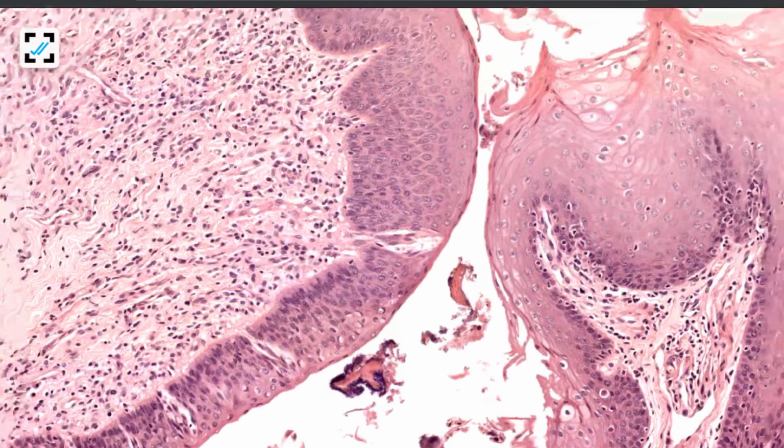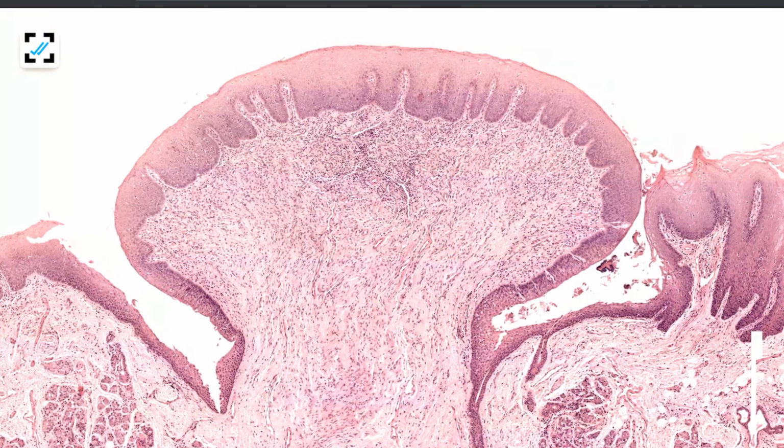To quickly summarize, circumvallate papilla are the largest papilla present in the tongue in front of sulcus terminalis. Each papilla, when viewed from above, appears round, surrounded by a trench or moat. The characteristic feature of circumvallate papilla is presence of vallum surrounding the papillae and then presence of taste buds within the wall of the papillae.